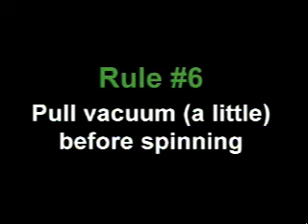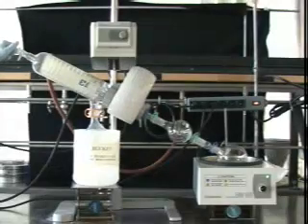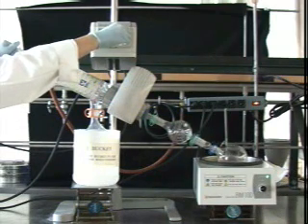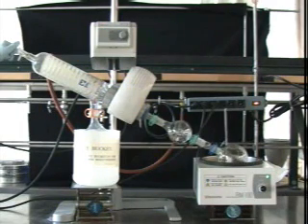Rule number six, pull vacuum just a little bit before spinning your flask. After you attach your flask, open the system up to a little bit of vacuum and start the rotary motor. If you start the spinning first without the vacuum to hold everything in place, your flask and the bump trap might end up floating in the water bath.